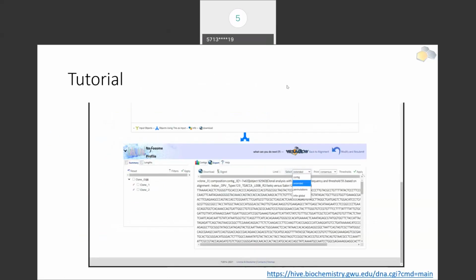I just want to show you here that at the end the tool allows you not only to display the quasispecies as this graph that I was showing previously, but it also allows you to export the sequences as shown here. You can choose which clone you want to focus on, then display it here and even download it. You can print its consensus, you can print the frequency of each one, and you can resolve it either as contigs or just infer the global sequences based on the Monte Carlo algorithm that has been described before.